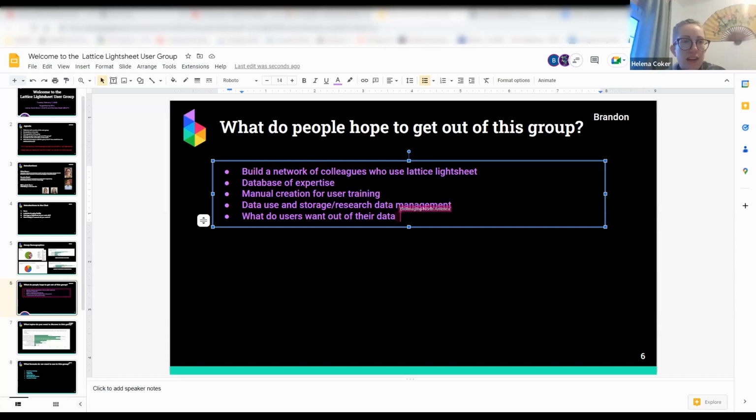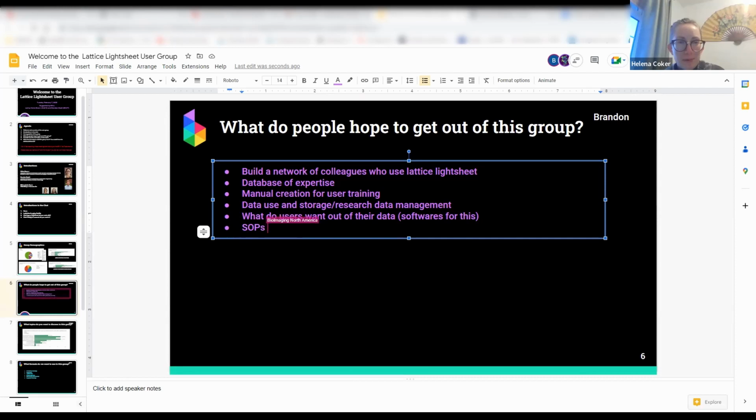If I can just add something. I think it's really been quite special what Quarep have done, trying to figure out standard things like SOPs for benchmarking, data management, trying to standardize some of this stuff. You can tell I'm a facility manager, going straight for the boring stuff. So going for that and thinking about what we can do to benchmark our systems and work out if things are working correctly would be quite nice. Sorry, my name is Helena and I'm from Oxford.